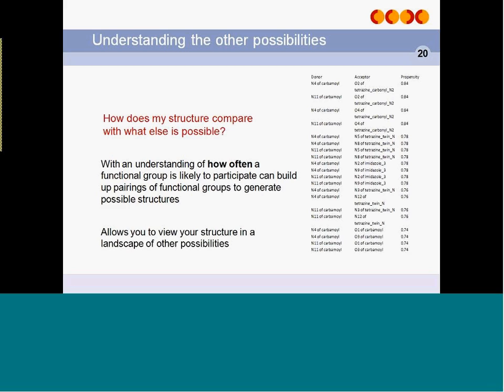So we gave that version of the tool to a Crystal Form Consortium, and they came back to us fairly quickly with some feedback about it, and that was that the tool, that table I just showed you, was very useful in identifying whether the candidate that you were currently looking at was likely to be stable, or whether it had some unusual hydrogen bonds in it which might indicate that it was possibly not the most stable form.